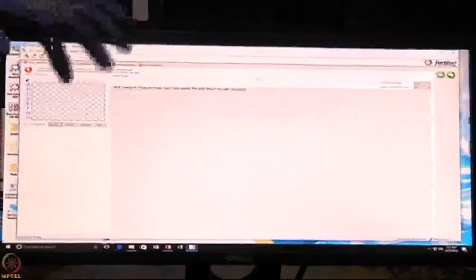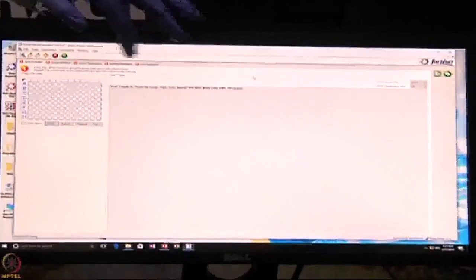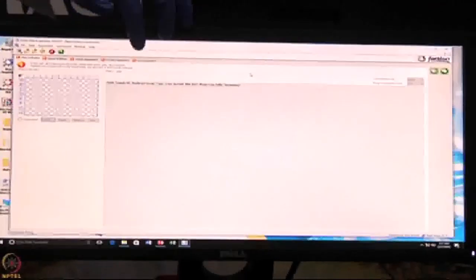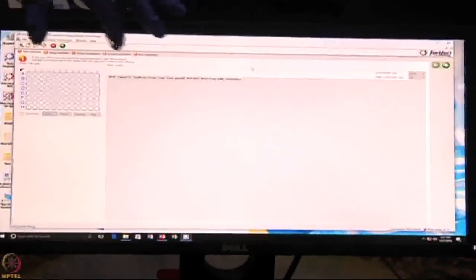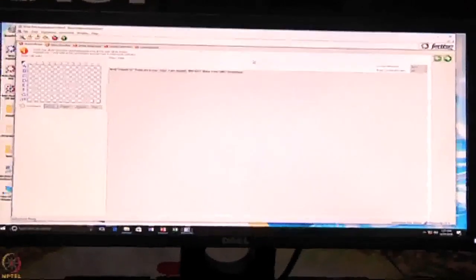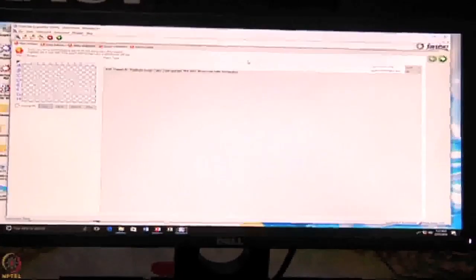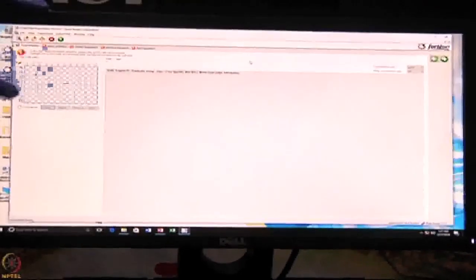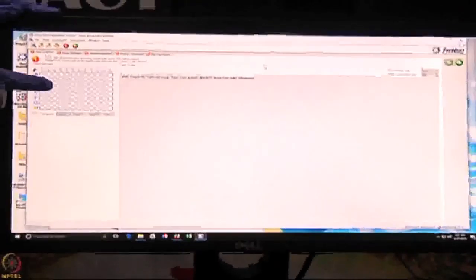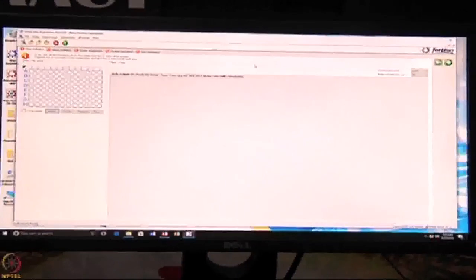Now if you look at this window, this is your plate format. You can see there are different panes: plate definition, assay definition, sensor assignment, review experiment and run experiment. These are the five pages you can design. In the plate definition, you have to feed the information on what you added in the plate. This is a 96 well plate format. In column 1 we placed buffer, the second column is load, the third column is buffer again, and the fourth column is sample, the analyte. We have to assign this information.